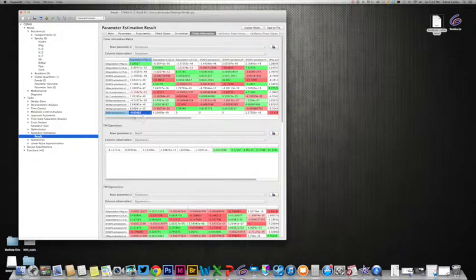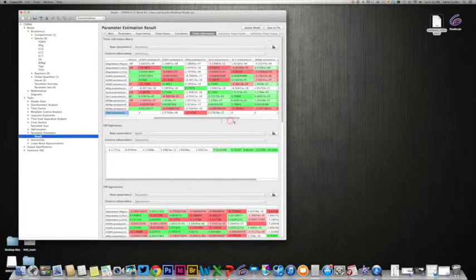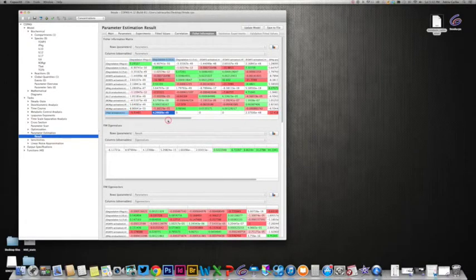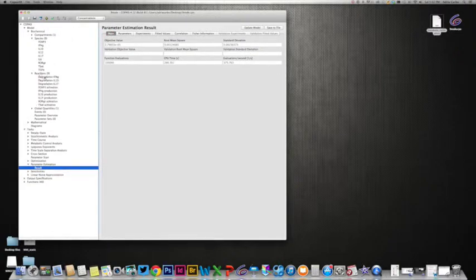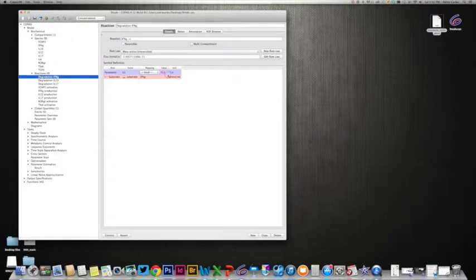There are a lot of parameters that you can assess in here, and as you can see, you can scroll. Let me check. You can scroll here on the right, yes, and there's a lot of parameters that you can check. What's most important is that the parameters are fitted, the standard deviation is low, and that the fitted value falls on the measure value, or the experimental value.